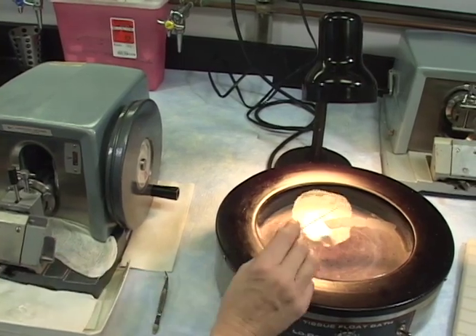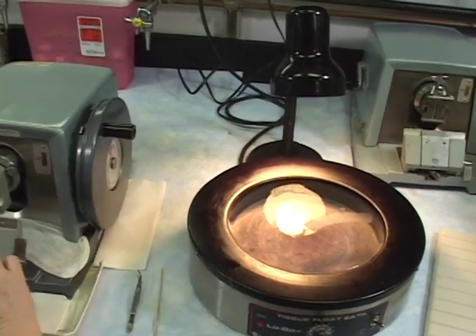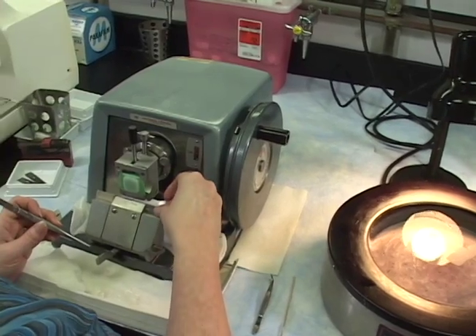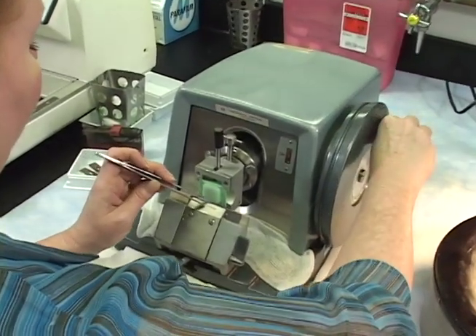Now I can still see the angle is slightly off for some reason somewhere. I'm either going to adjust to that, or I'm going to want to make my ribbon a little bit nicer. Maybe I'll move my knife over and just kind of see if that happens to help it.